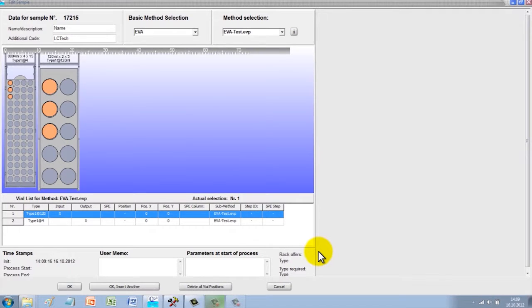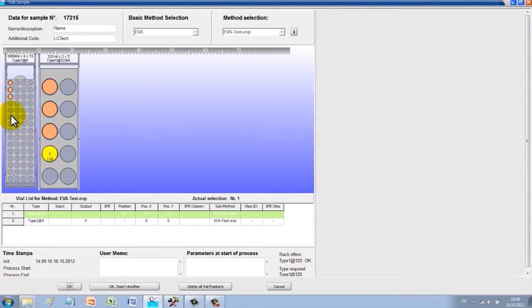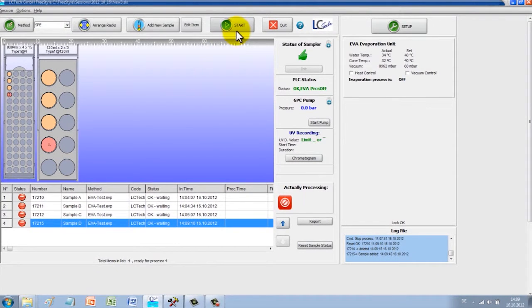The software for your daily routine is incredibly easy to use such that even less experienced staff can operate the software confidently and process samples fast and free of error. Place samples into the device, register in the software, select the method for the samples and start processing. Done.